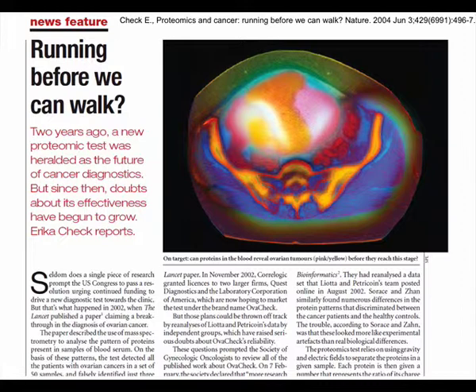So what happened is that the data was available, so other people started analyzing it also. Then they saw that there were some problems with it. One thing they saw was that, again, like in the previous example, the control group and the ovarian cancer samples had not been treated the same way, and mainly not been analyzed the same way. The ovarian cancer samples had been analyzed first, and probably the normals later. So the same thing as the other example.